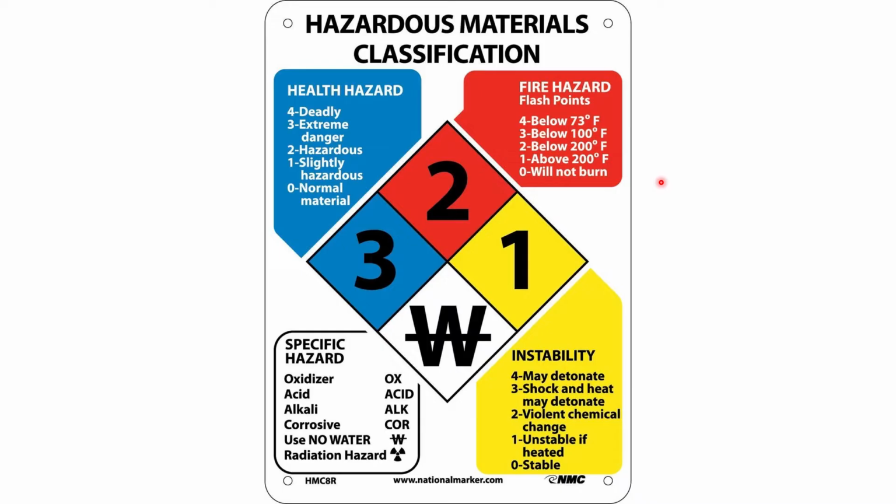By just looking at it, class, emergency personnel can assess health hazards. So, health hazard for the blue quadrant, the flammable hazards, that's for the red quadrant. There's also the reactivity or stability hazards that's found on the yellow quadrant, and other special information that's found in the white quadrant.